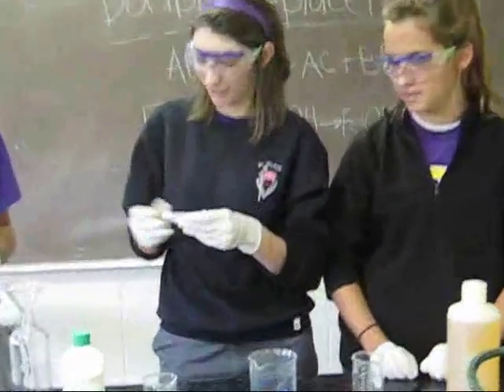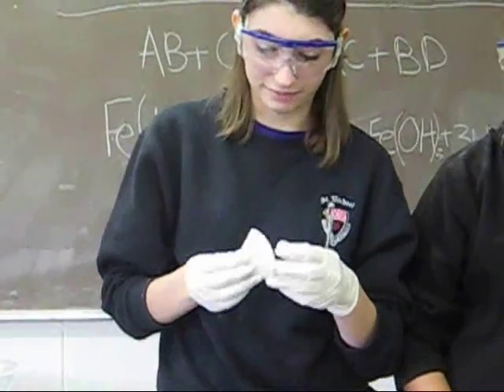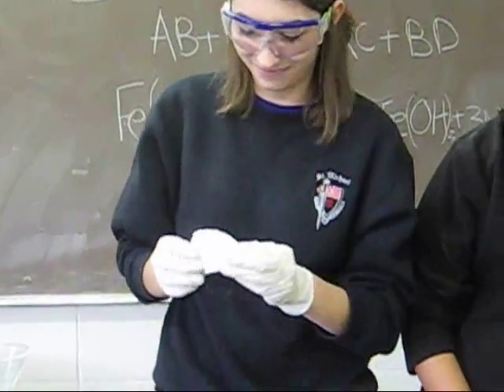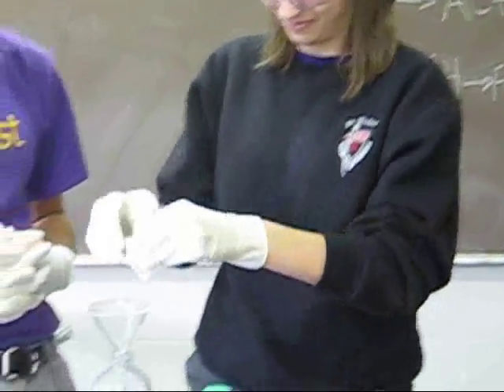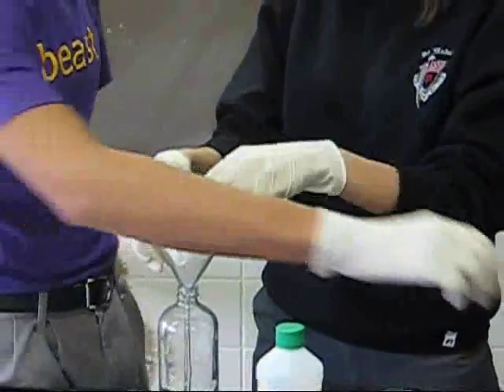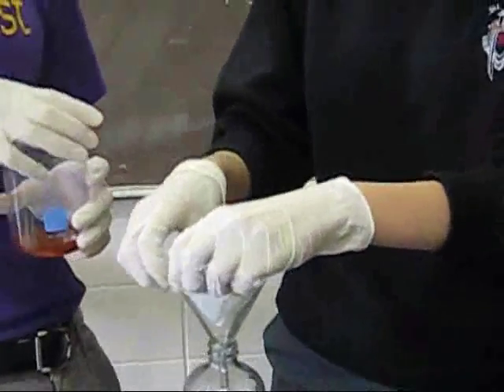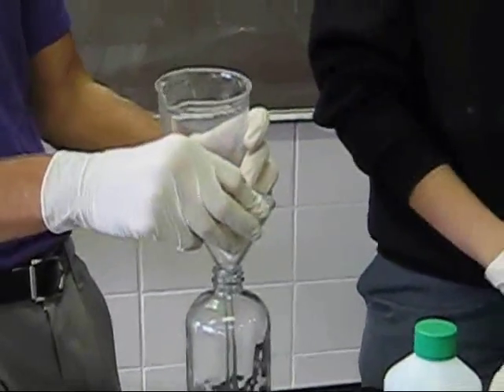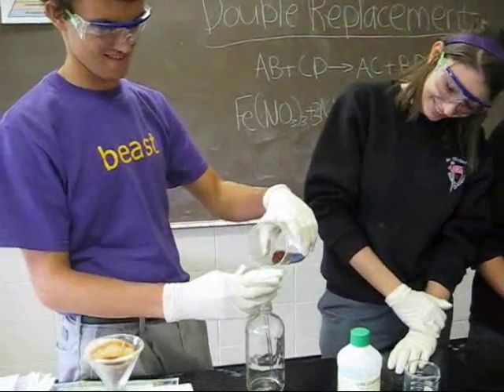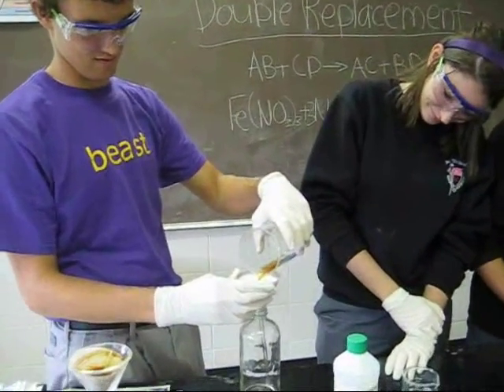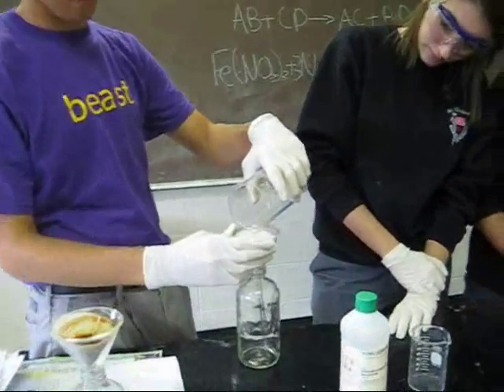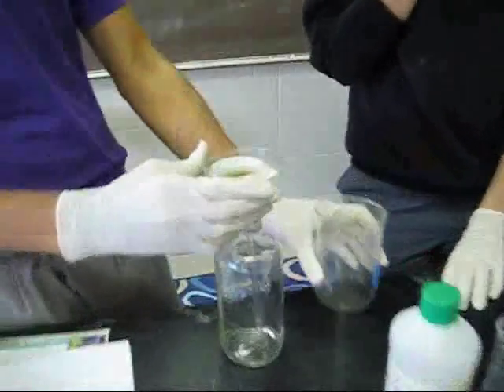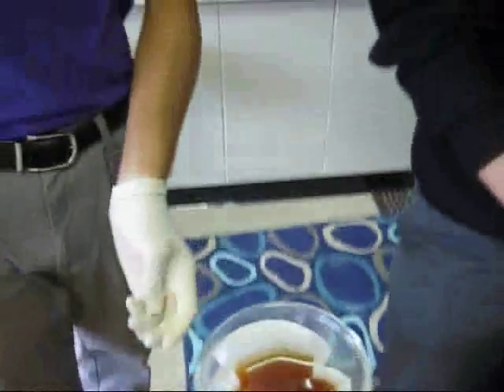We are going to filter it out. Once it filters, all the aqueous solution goes to the bottom and the solid is left over at the top. That's what it looks like when it's done.